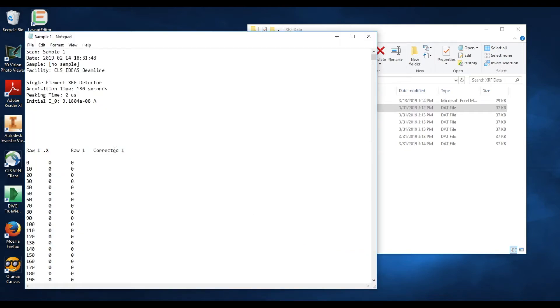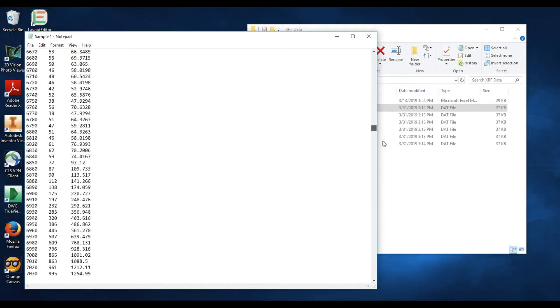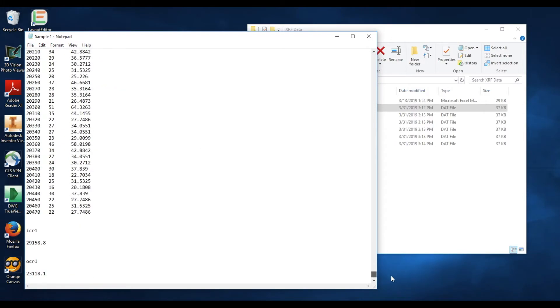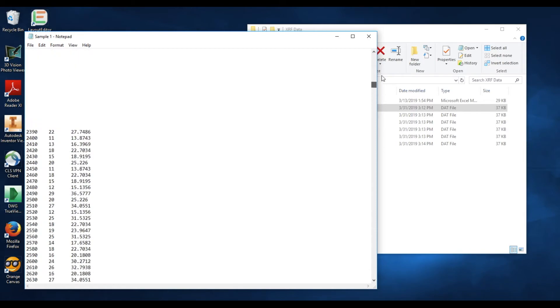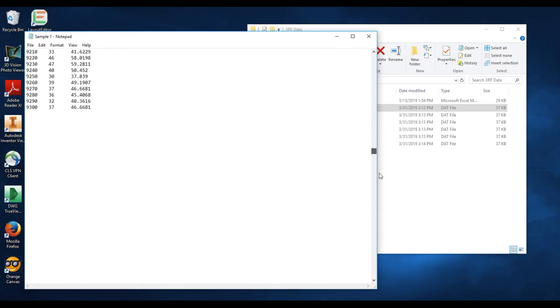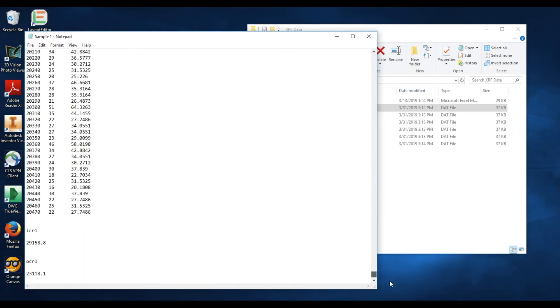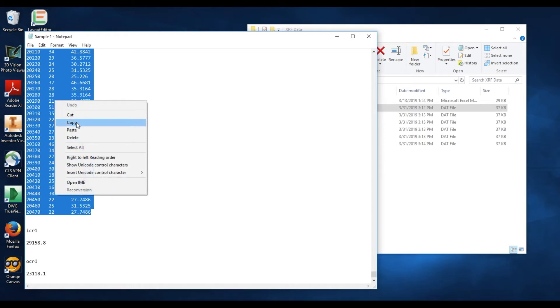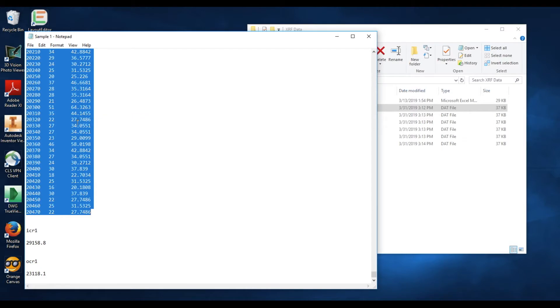Now we want to copy all of this data, starting from RAW1X all the way down to the bottom, excluding this ICR1 and on. So we go back up to the top, make sure you select the RAW1X right before that, go all the way down to the bottom, hold shift as you select just after the last number input in that column set, and that will select that data. Now right-click it and select copy.